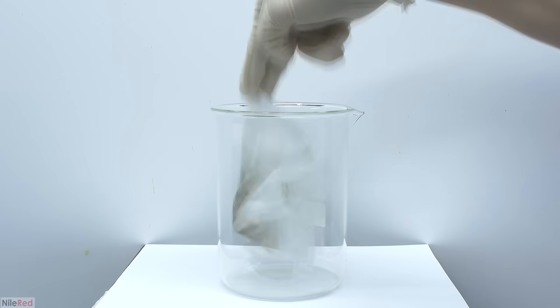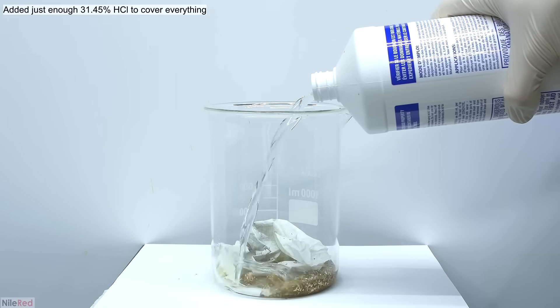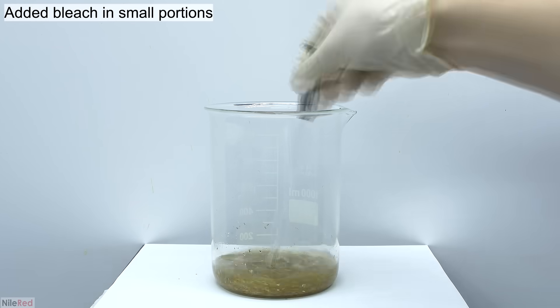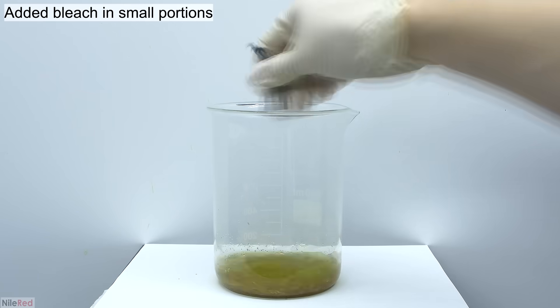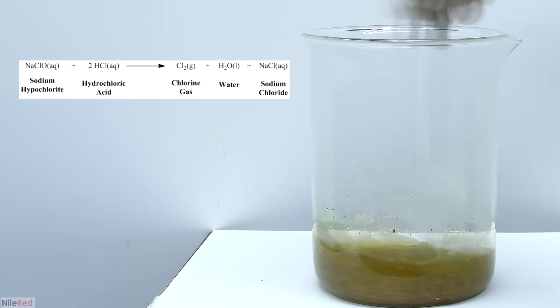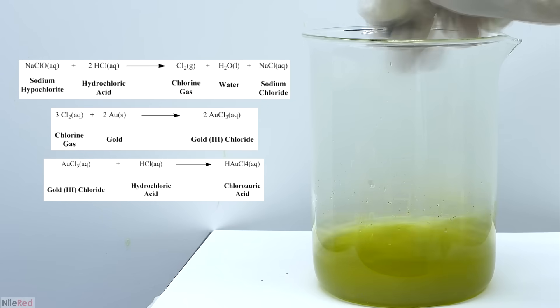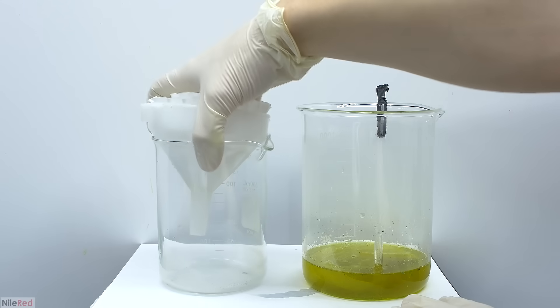I dropped the entire filter paper into a beaker and opened it up so that some of the gold flakes could fall out. This time to dissolve the gold I'll use the other method which involves hydrochloric acid and bleach instead of nitric acid. The first part is pretty similar where we add hydrochloric acid until everything is more or less covered, and then we slowly add small amounts of bleach with a lot of stirring in between. We really want to use as little bleach as possible, which is why we add it in small portions. When bleach is mixed with hydrochloric acid it produces chlorine gas, and the chlorine oxidizes metallic gold to gold chloride. Then like we saw with aqua regia, the gold chloride that forms reacts further with hydrochloric acid to form chloroauric acid. Eventually after enough bleach has been added all of the gold has dissolved and we're ready to filter things off.